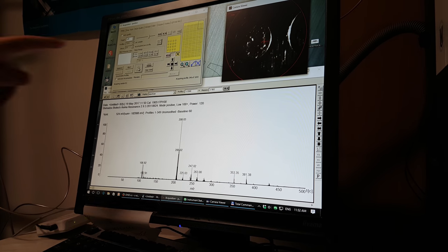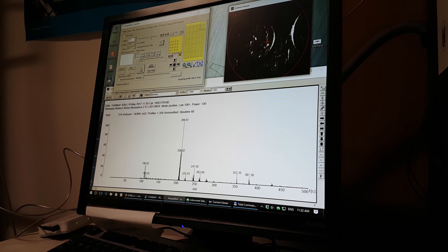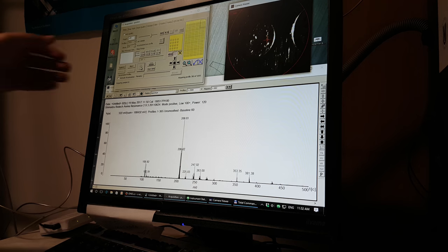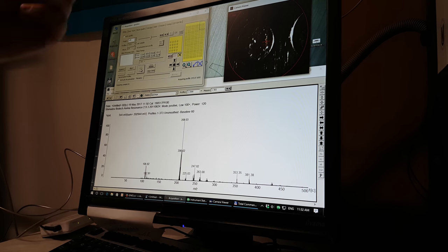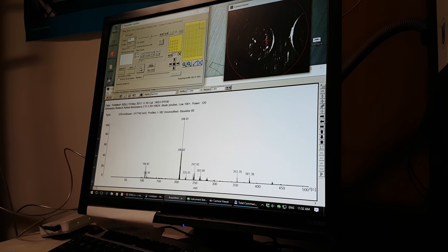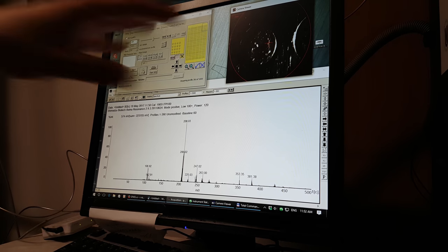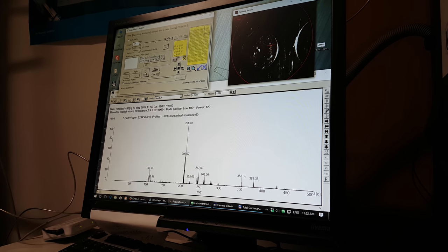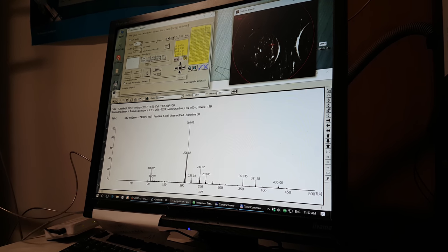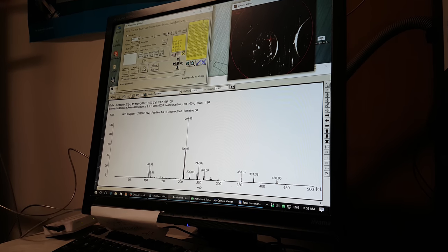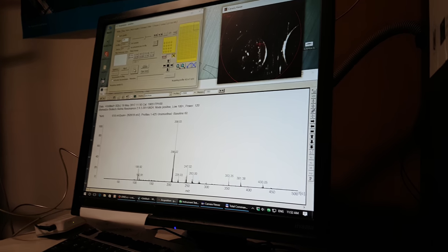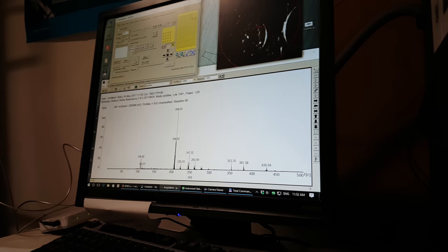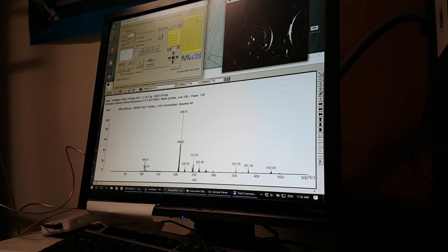We can use one shot per scan or two shots per scan, but one shot is better for powder samples. With high energy, the powder may go everywhere and contaminate the instrument.